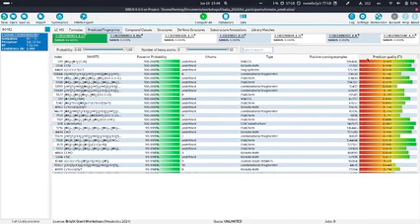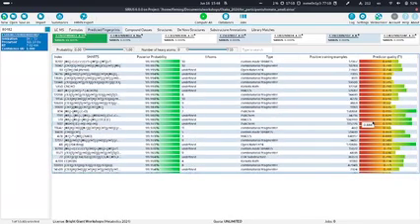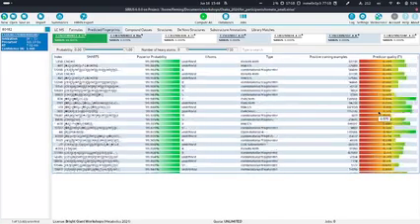But what also is important is the predictor quality, which means how much should we really trust this predictor? I will show also an example for this. This just means if we have a high score here, this particular predictor is trustworthy, and if we have a lower number, we should be careful.